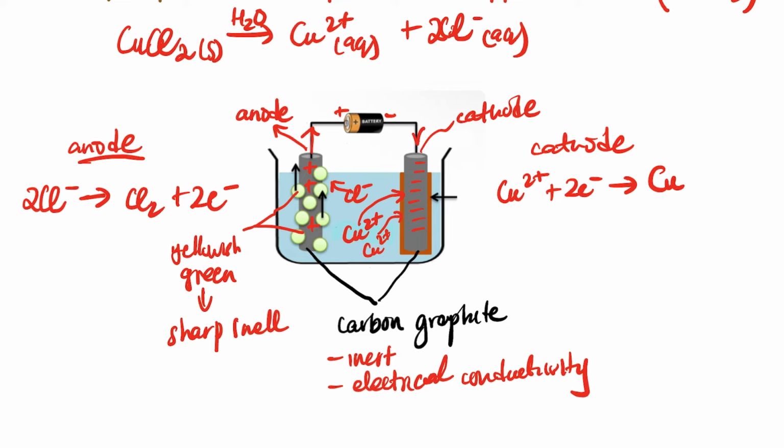The copper in a solid state, which is this copper here. This solid here is formed when the copper ions are reduced, which means they gain these electrons, and they form this deposition of the copper. It's this color, a brownish red color of the copper there, right? And I hope it makes sense, guys.